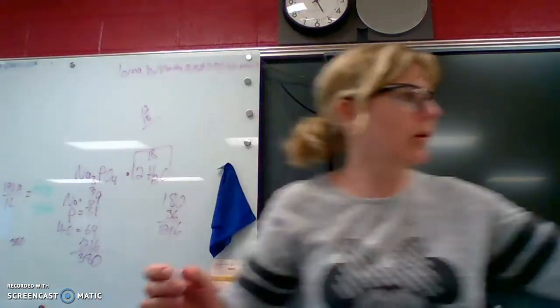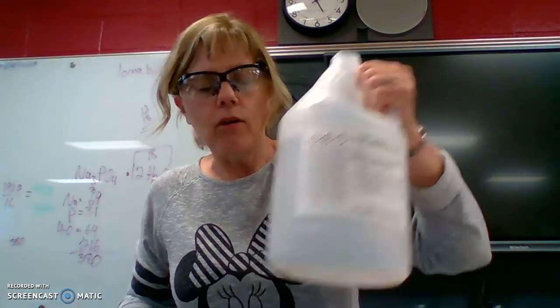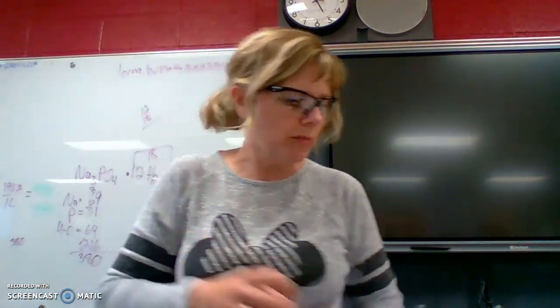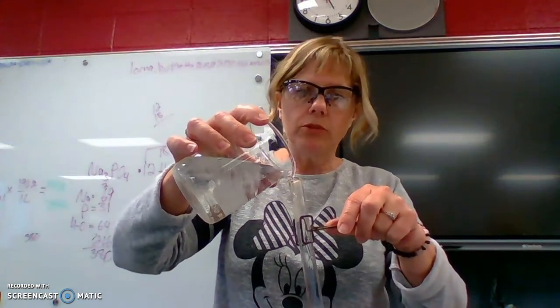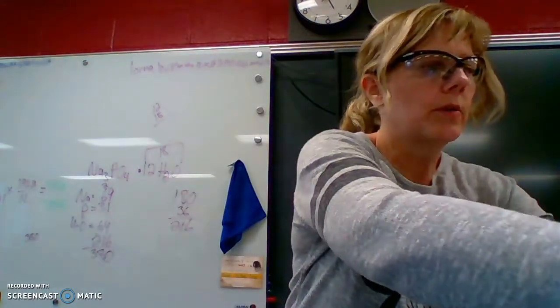Okay, for the very last lab, I don't want to have this anywhere near me, you're going to use a little ethyl alcohol. It's super flammable. I'm just putting, like it says 40 drops, I've kind of already pre-measured some of that, in an evaporating dish. And then I'm using really cold water, so I have ice water. And it says to fill a test tube about 2/3 full. This has to be really cold, otherwise it won't work. Then I'm going to light the alcohol. It's super flammable, like we don't want it to spill at all.